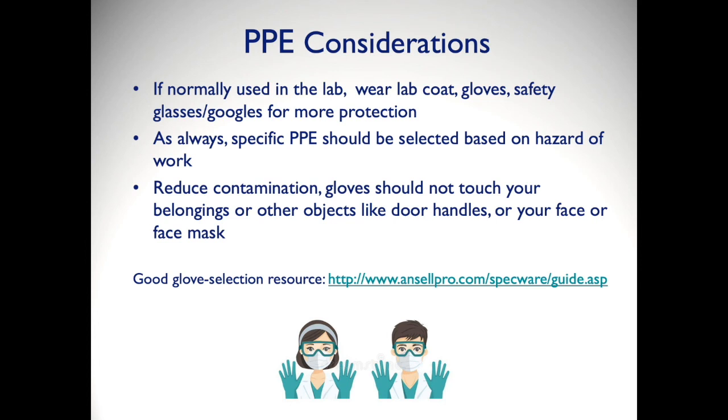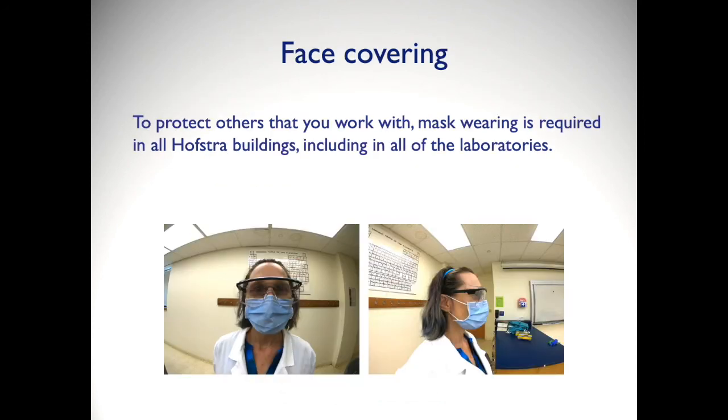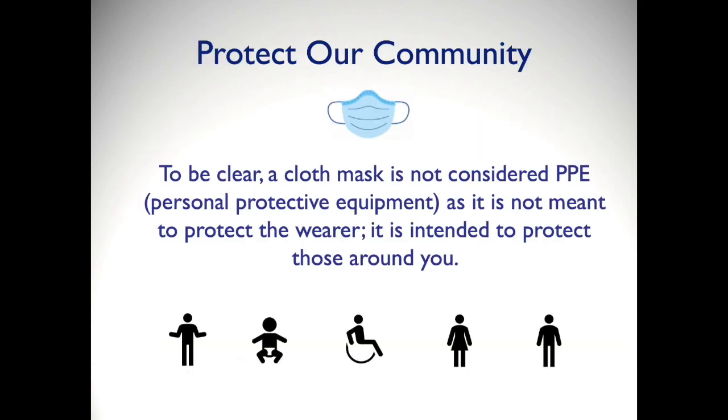Reduce contamination. Gloves should not touch your belongings or other objects like door handles or your face or face mask. To protect others that you work with, mask wearing is required in all Hofstra buildings, including in all of the laboratories. To be clear, a cloth mask is not considered PPE, as it is not meant to protect the wearer. It is intended to protect those around you.